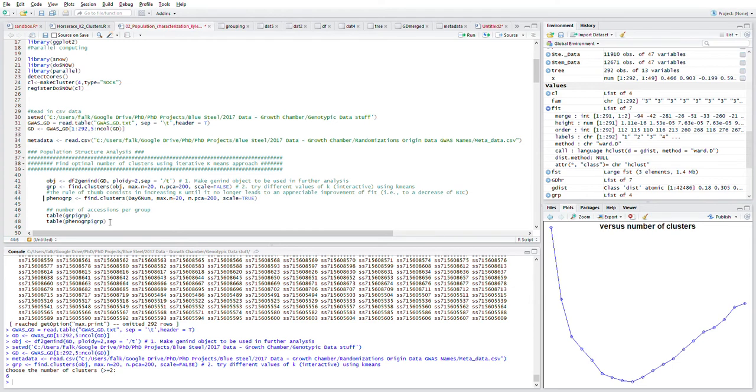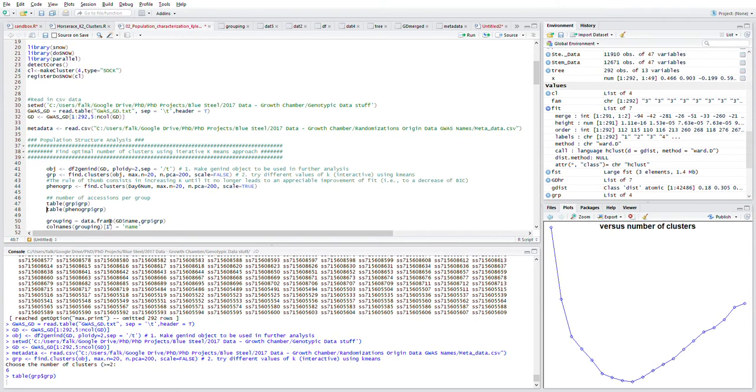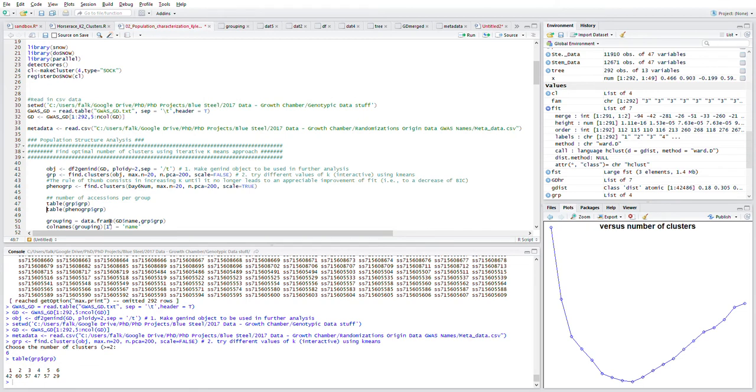Now moving on, I'm going to skip this because this is for the phenotypic data. I've set it up kind of in parallel with my genotypic data. I'm just going to look at the table to table out the data.